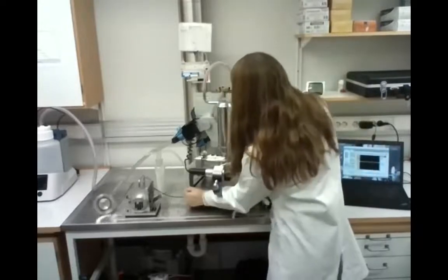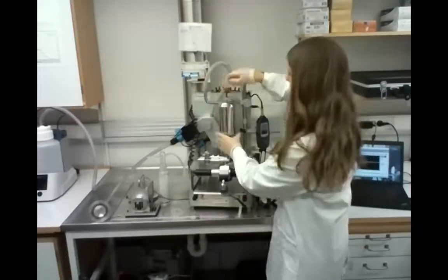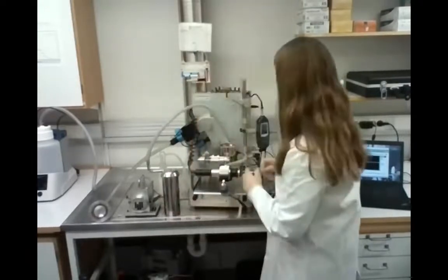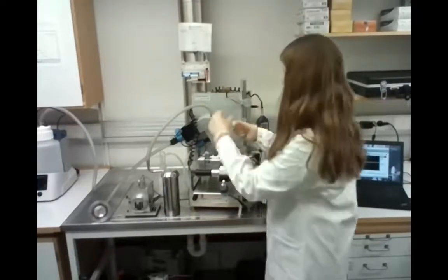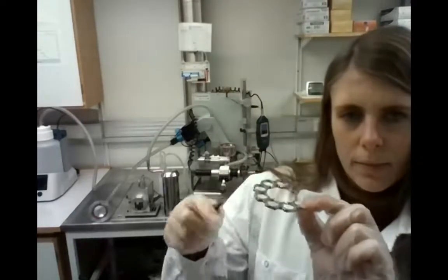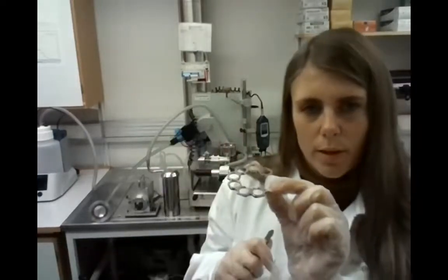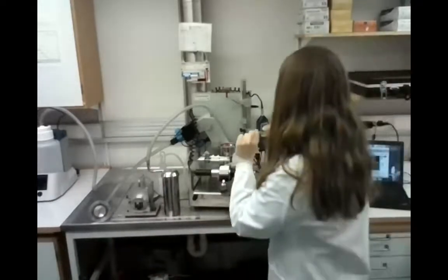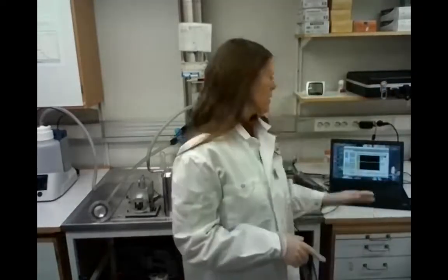And for the Dissolvit setup, inside this chamber, we have a glass cover slip holder. It looks like this. And in these holes, you will put your glass cover slips that will be used with the Dissolvit instrument. One of these slips you can, for example, also use for SEM imaging. Everything is also steered from the computer as well.